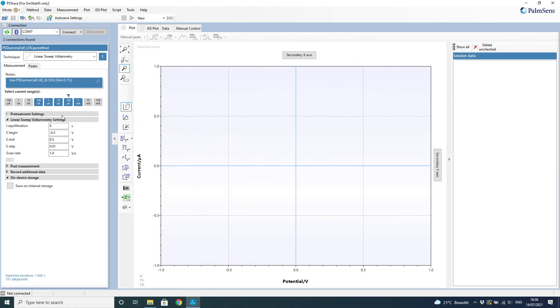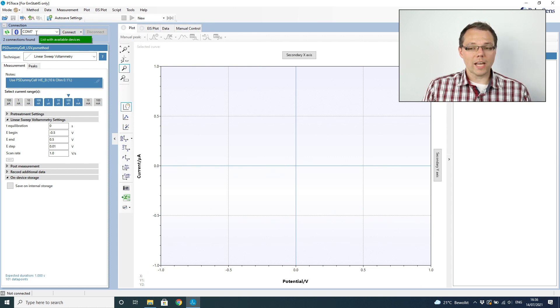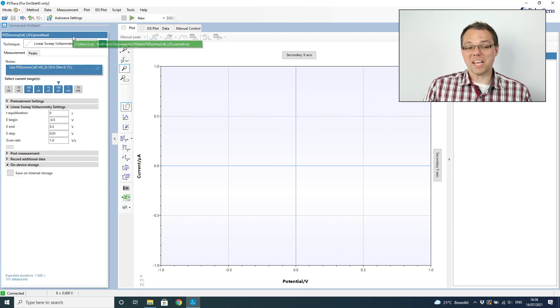Now we have set up our measurement and we're ready to use the software to control the potentiostat. I've already installed and started PS Trace on this computer. First, we need to tell the software that we have an instrument to connect to. On the top left, you find the connection section. In this drop-down list you should see the EmStat 4S as an available device. If you don't, you can refresh, and most of the time you will find it. If not, check that the USB connection is done properly. Then press the connect button — we're connecting and we are connected.